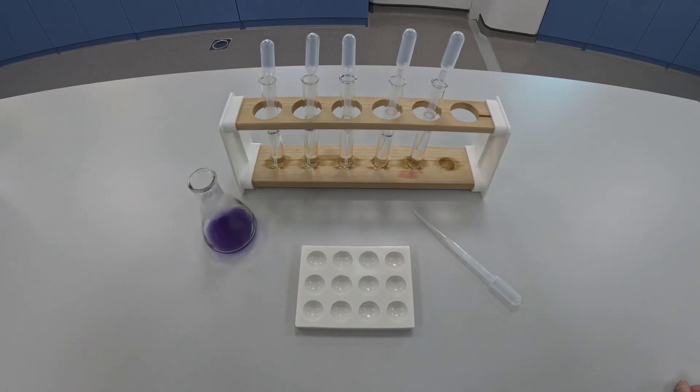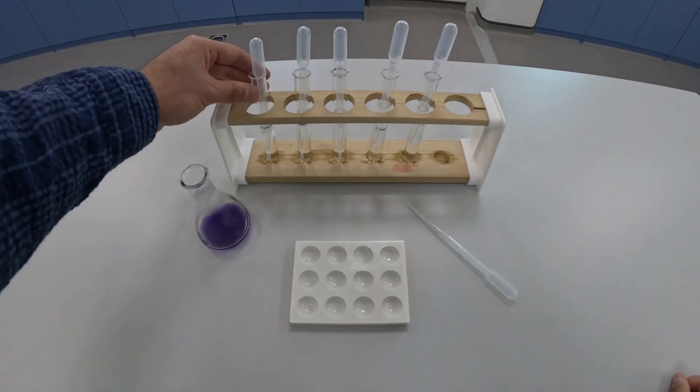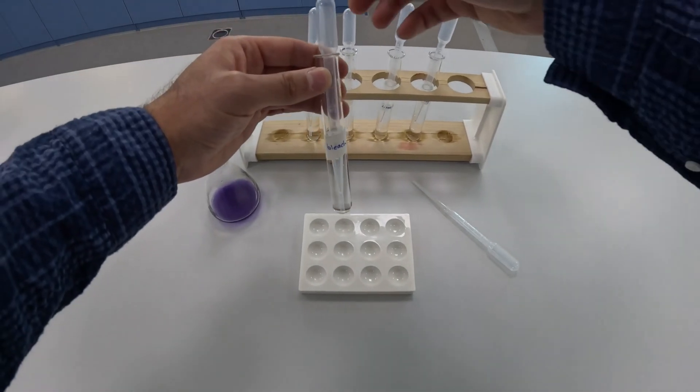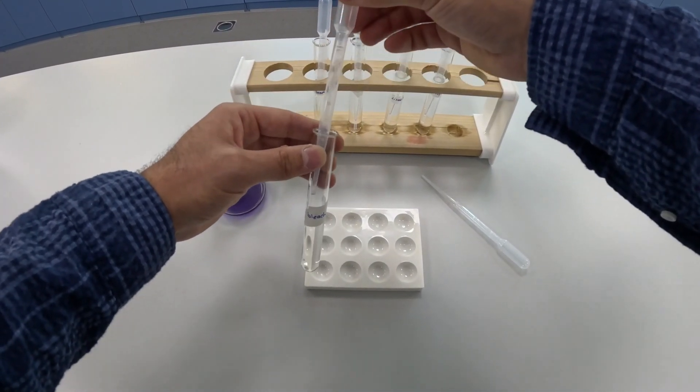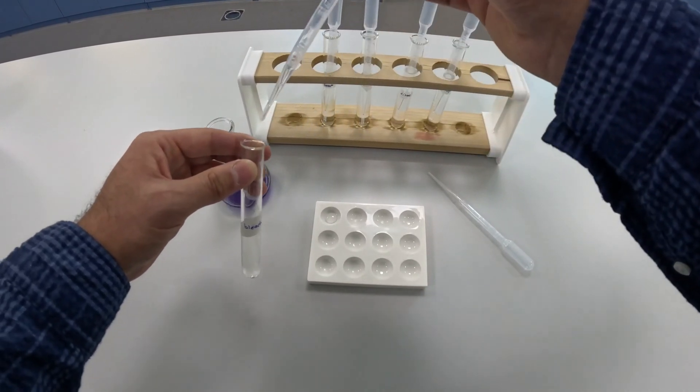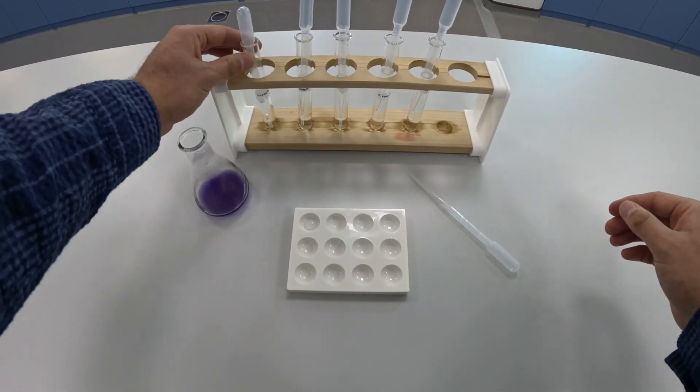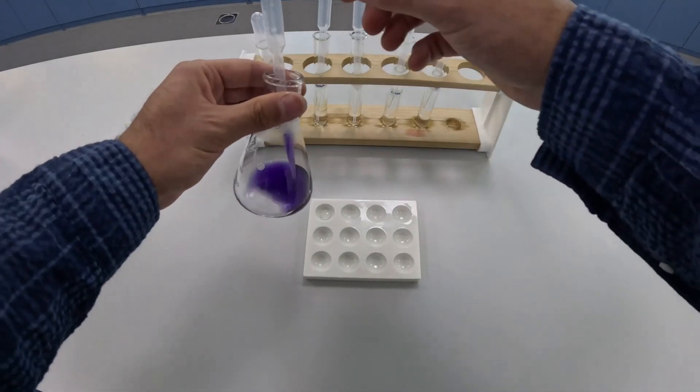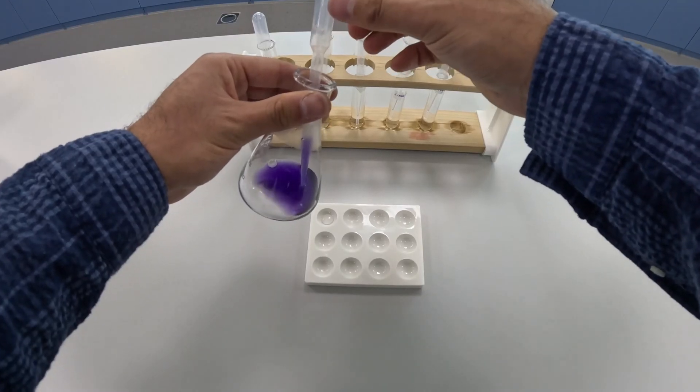Now we're going to test our indicator on some different substances. The first one we're going to use is bleach. I'm going to add a few drops of bleach into the spotting tile, and then I'm going to add a few drops of my indicator to the bleach and observe the color change.